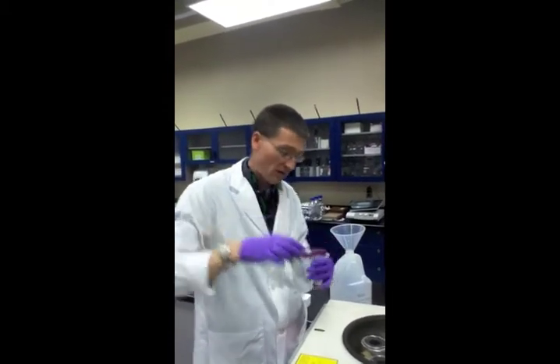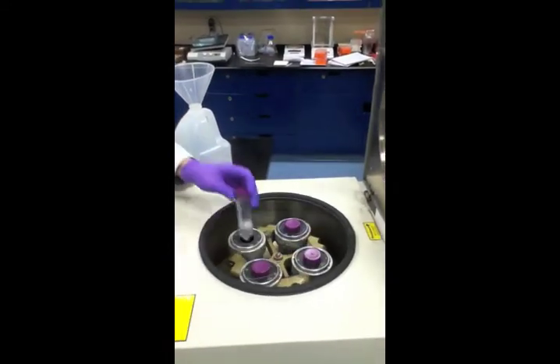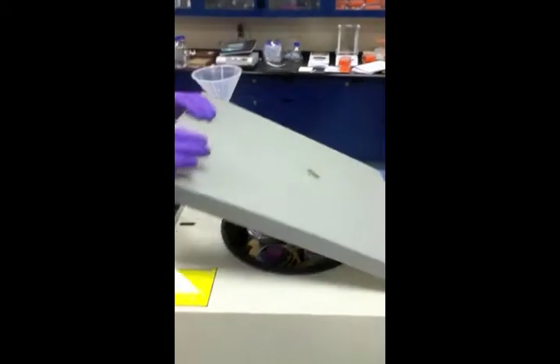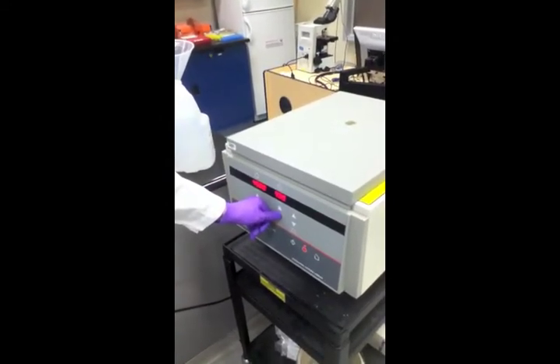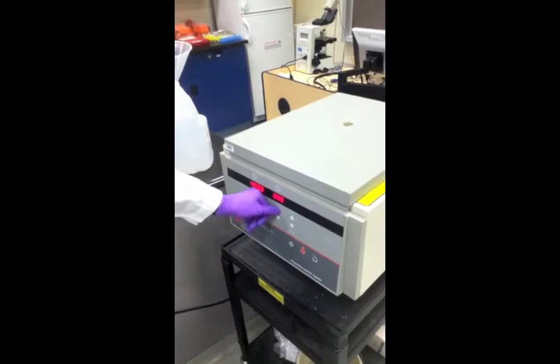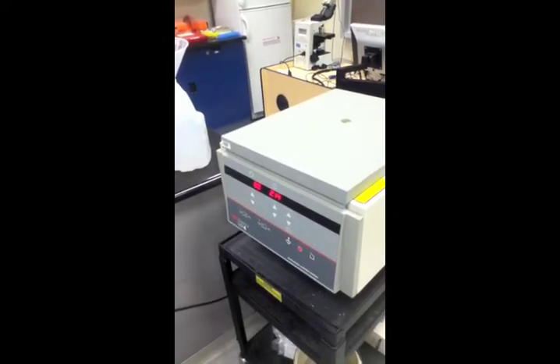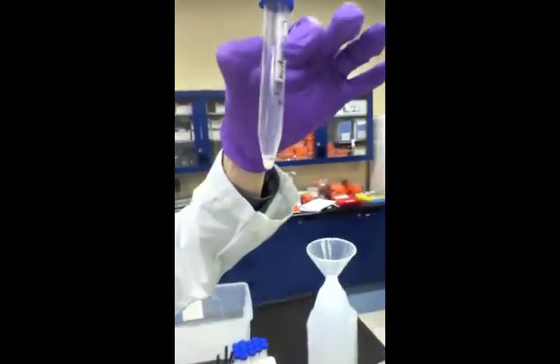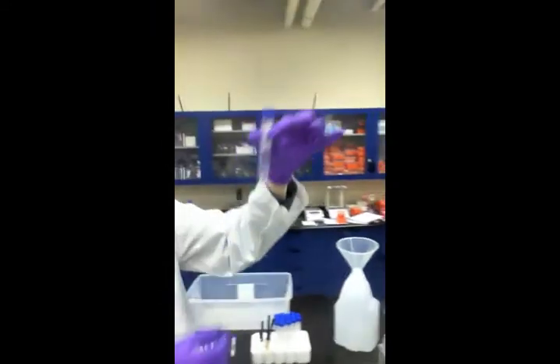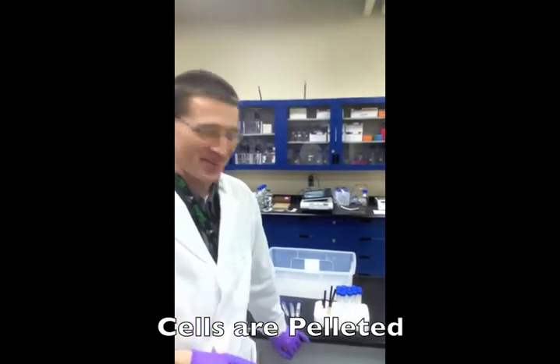We have to concentrate it, and that's what we're using the centrifuge for. I'm going to put your samples into the centrifuge four at a time, so I'll be here all night. We'll centrifuge at a fairly high speed for about 2 minutes, and that will concentrate the cells at the very bottom. Start. We'll end up with a little white pellet, which is hopefully mostly cheek cells that look something like that. Hopefully you didn't see the name, so that person won't be embarrassed, but it is cheek cells.